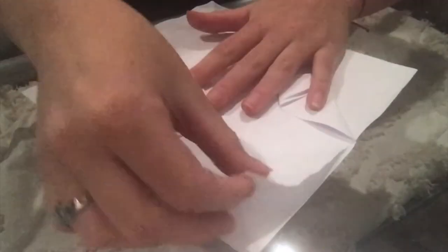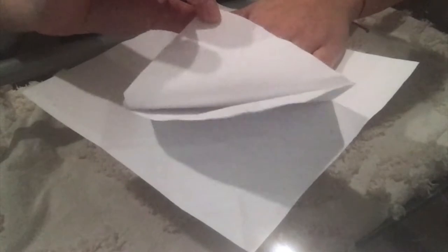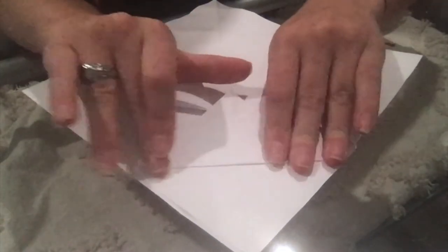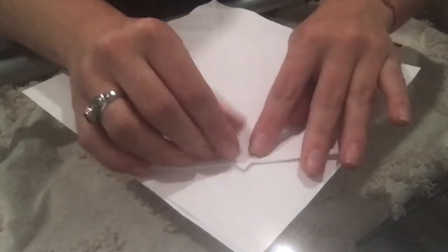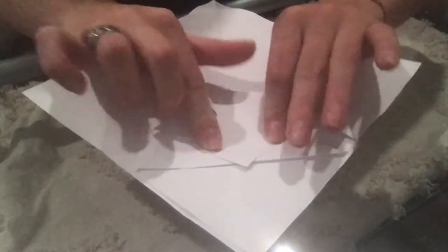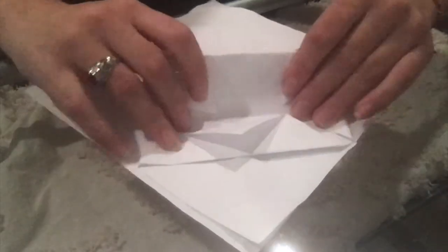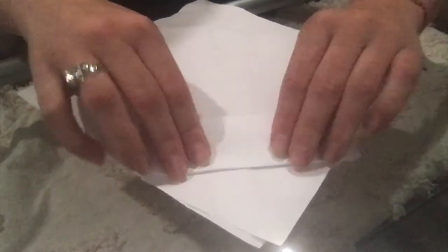Then grab the top paper — since we have two — and fold it down just like the others, and do another doggy earring. Then grab the bottom, wrap it, and make it look like an envelope.